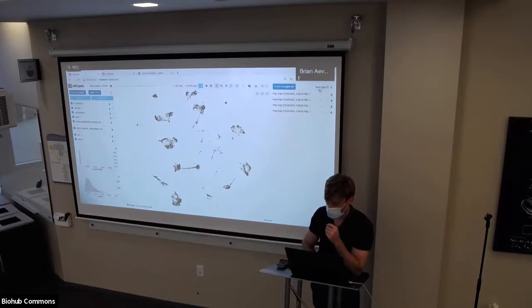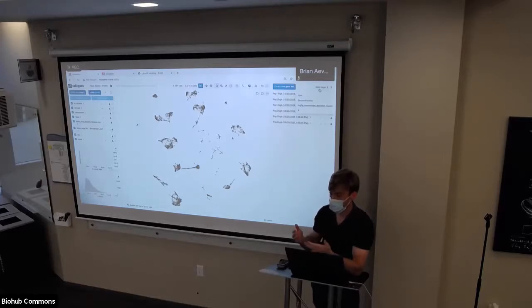There's this data layer thing. If you have other counts or other transformed counts that you want to visualize the expression of, or select using brushable histograms, you can actually choose which layer of data you want. There's an attribute in AnnData called .layers. And let's say you've loaded in a data set that starts off with processed data in X, but has a layer that has raw counts in there, like here, X counts or raw or whatever.